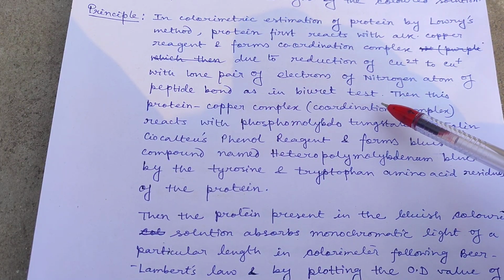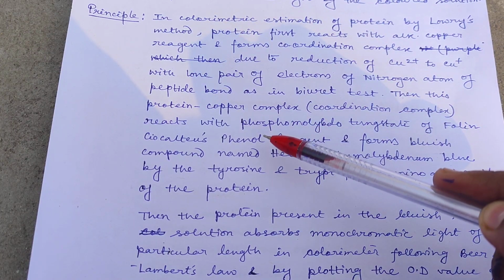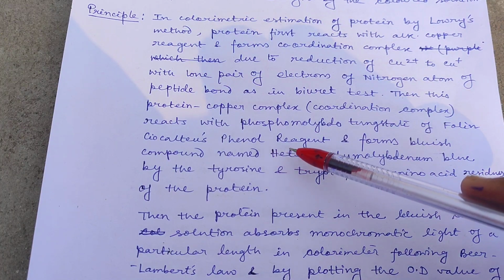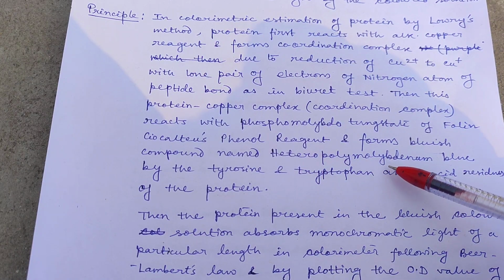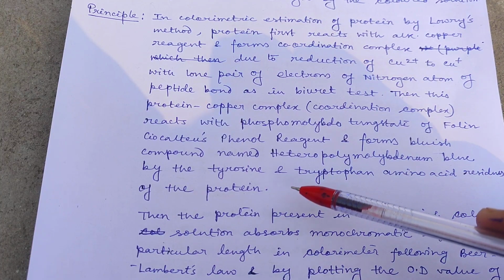Then this protein copper complex reacts with phosphomolybdotungstate of the Folin-Ciocalteu phenol reagent and forms a bluish compound named heteropolymolybdenum blue by the tyrosine and tryptophan amino acid residues of the protein.